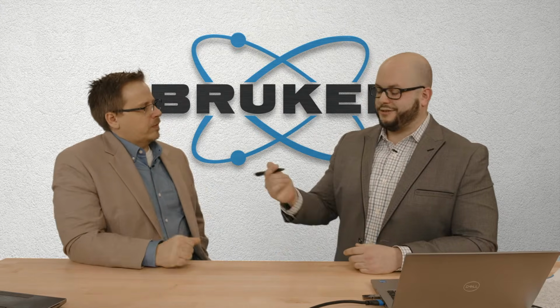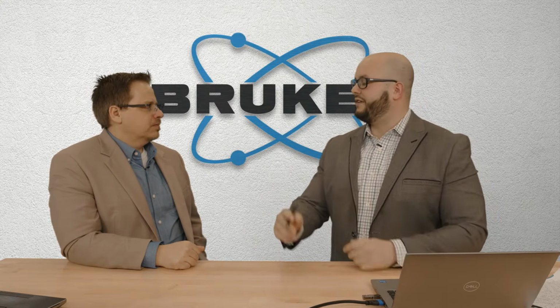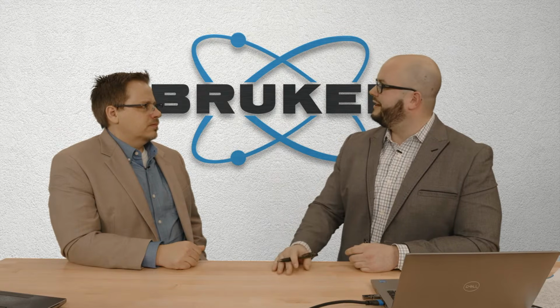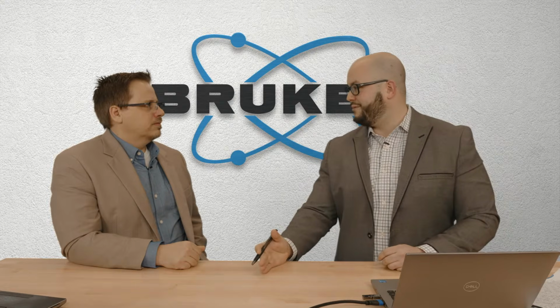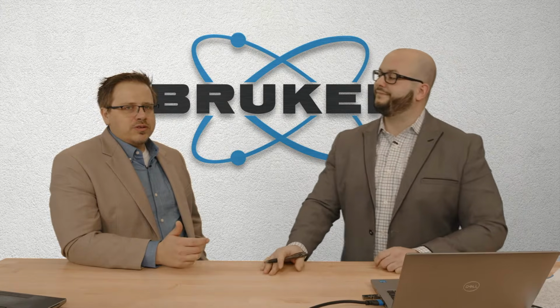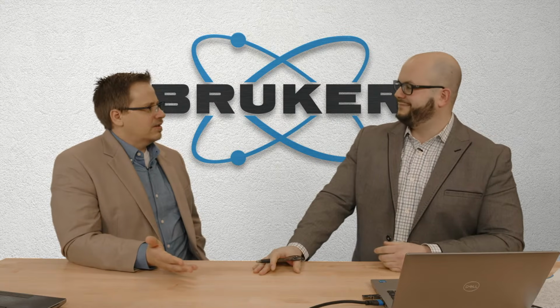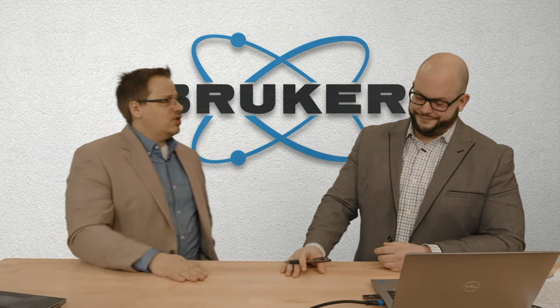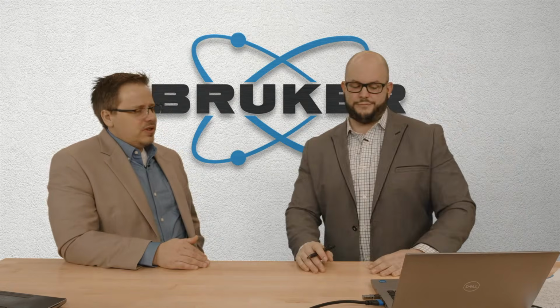That's another thing, excellent point. With the longer wavelengths, our peaks are going to be shifted out, and there's a really nice iron alpha 211 reflection at around 150 degrees. Higher angles are preferred for stress measurements because that gives us more sensitivity in our d-spacing measurement. That's the blessing and a curse with iron, especially ferrite. It's a simple unit cell, so you don't get a lot of reflections. They're bright, but you don't get a lot of them. So the fact that you can shift that peak up to something like 155 really helps you out.